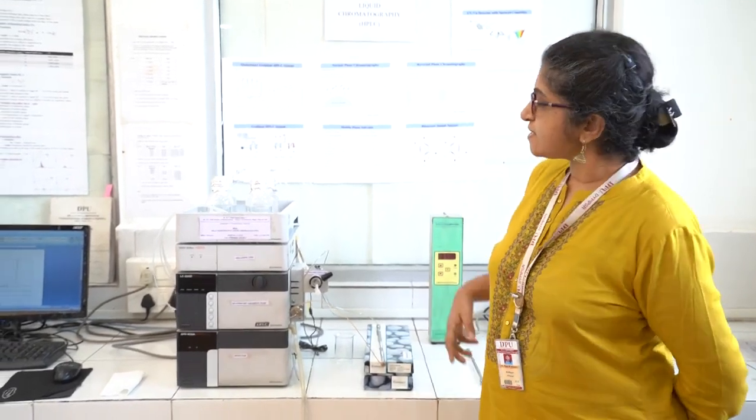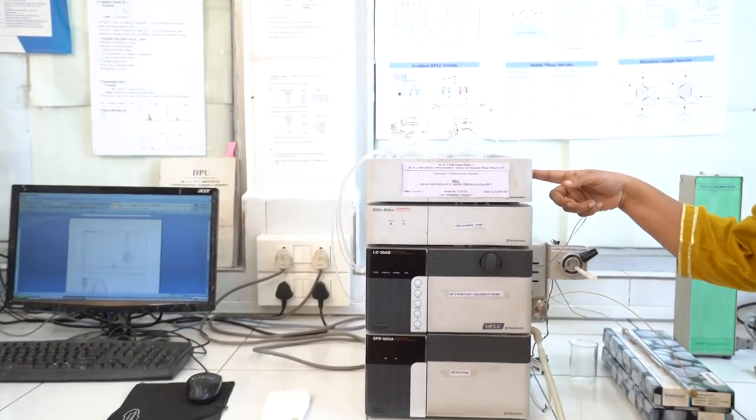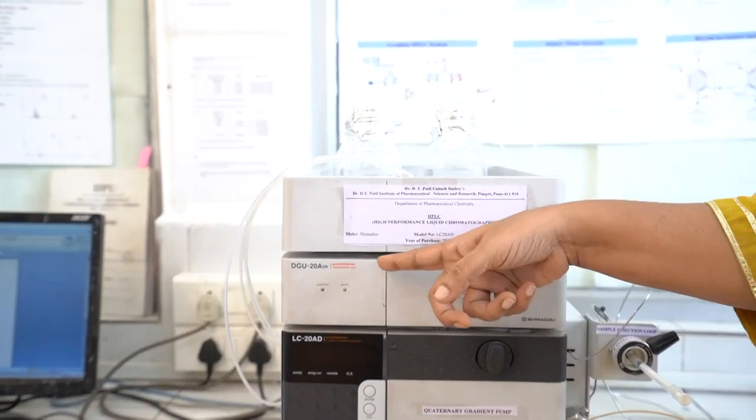High Performance Liquid Chromatography, or HPLC as it is more commonly referred to, is basically a separation tool in which we can separate a mixture of complex analytes into its individual components. This is a quaternary gradient HPLC system, make Shimadzu.